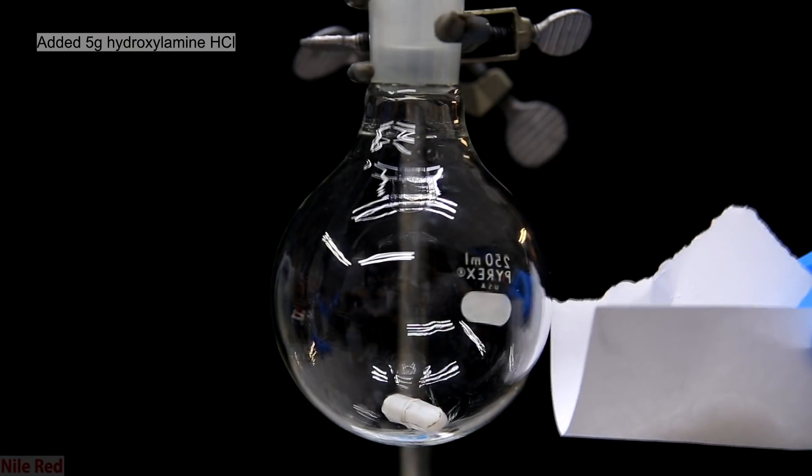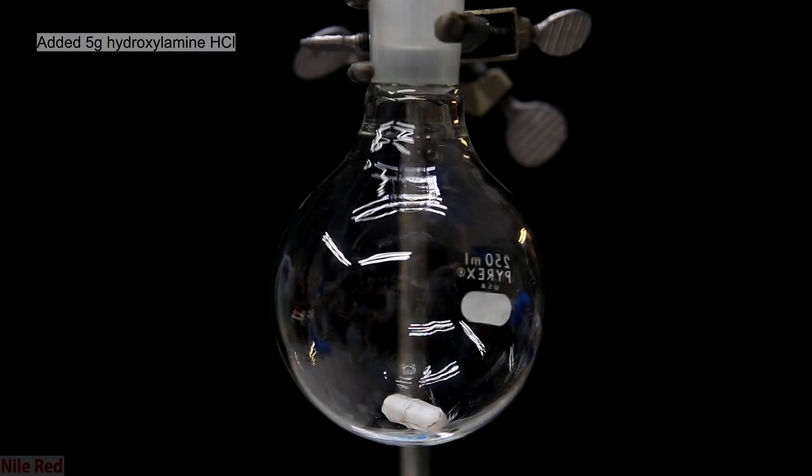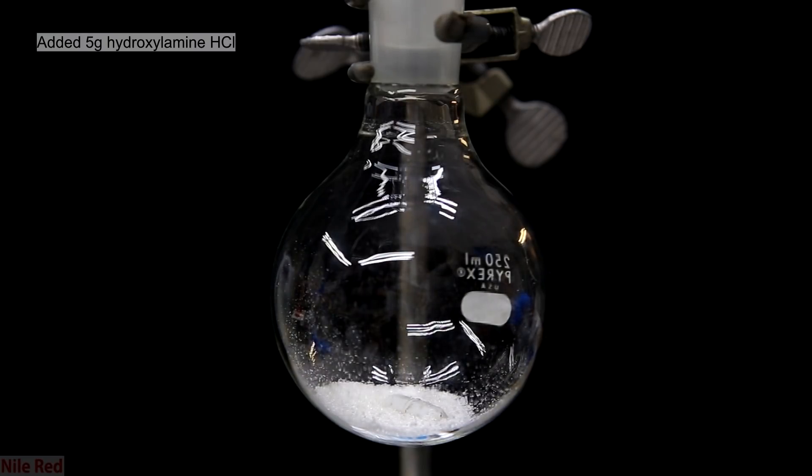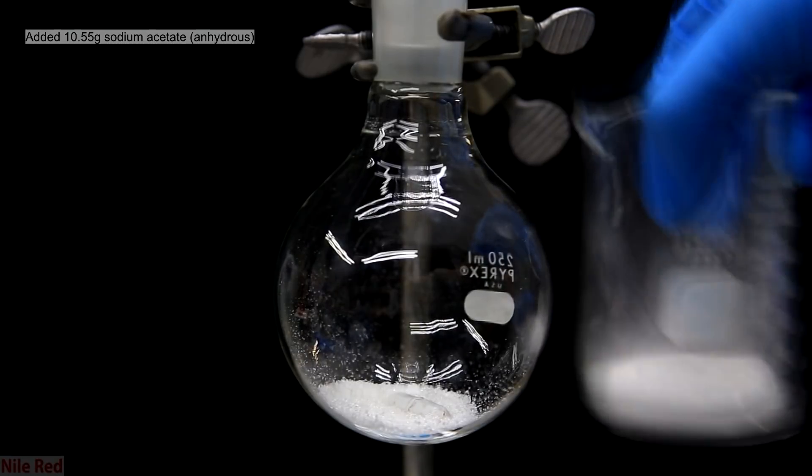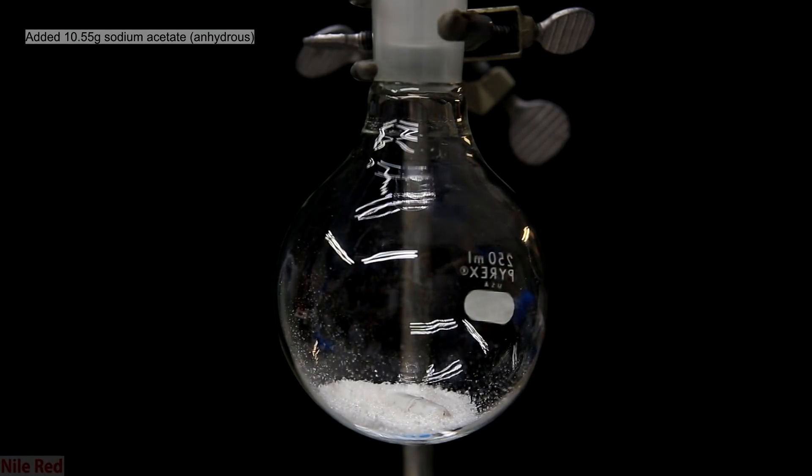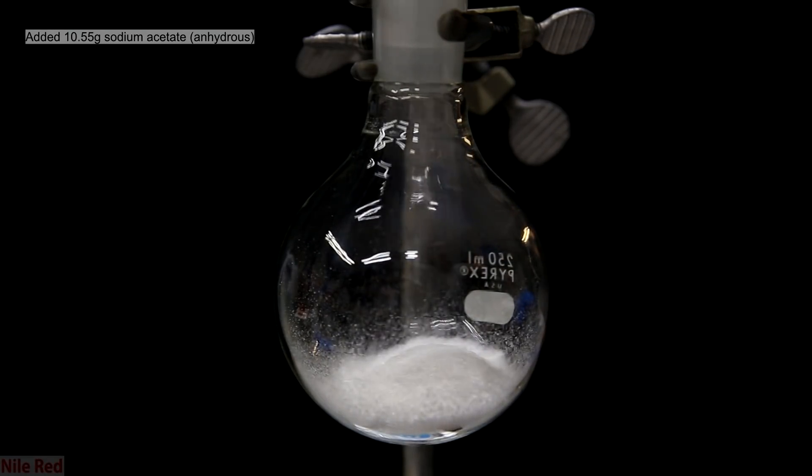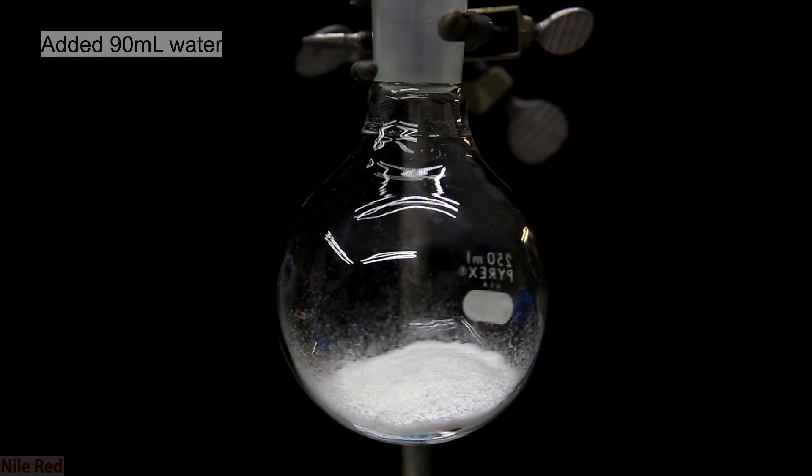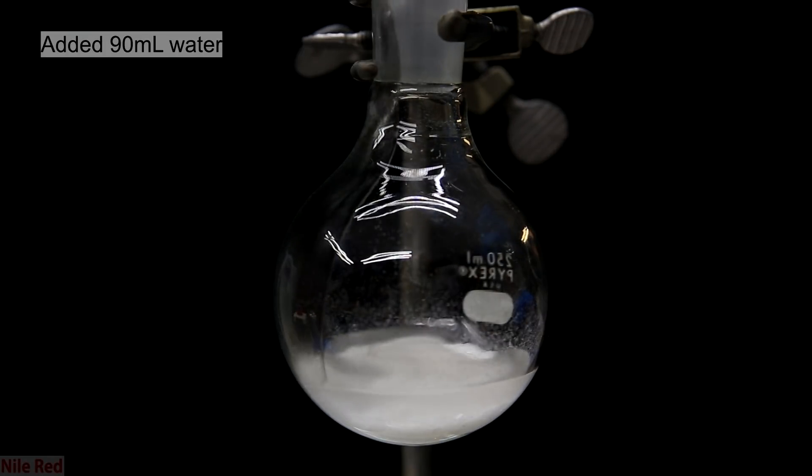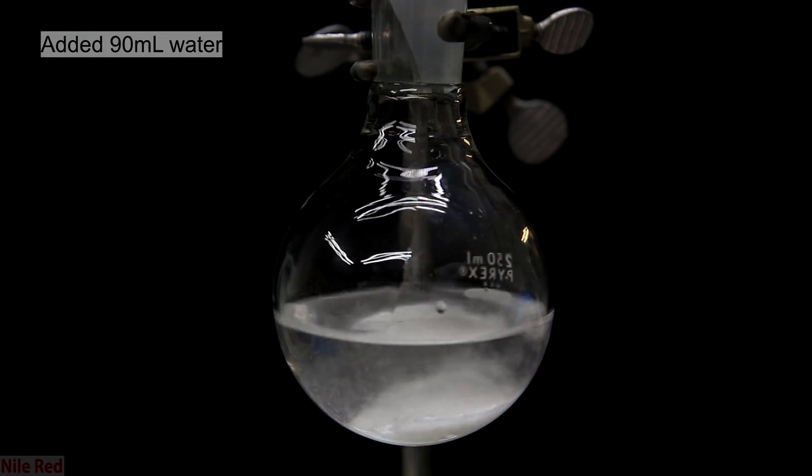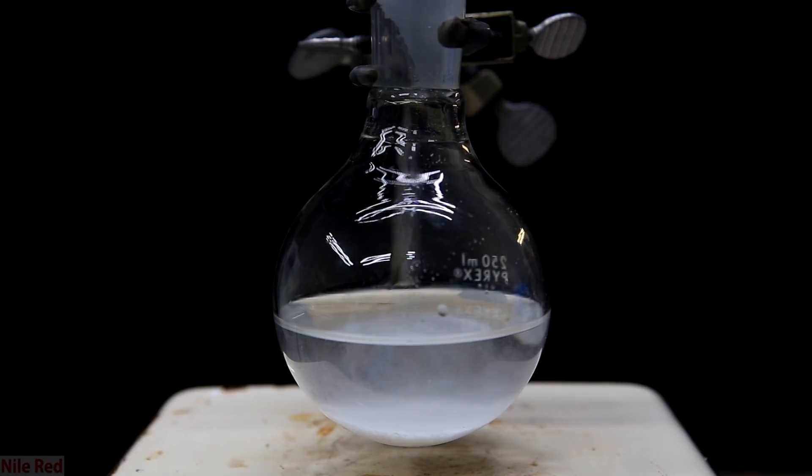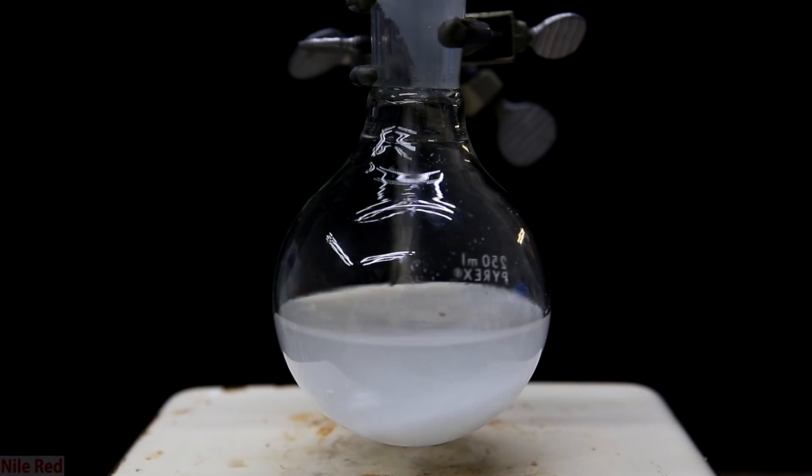The order of the addition really doesn't matter but I started out by adding the 5 grams of hydroxylamine hydrochloride. The next thing that I added was the 10.55 grams of anhydrous sodium acetate. On top of these two powders I poured in 90 milliliters of distilled water. I place a stirring plate below the round bottom flask and I add in a magnetic stirrer and then I stir until everything is dissolved.